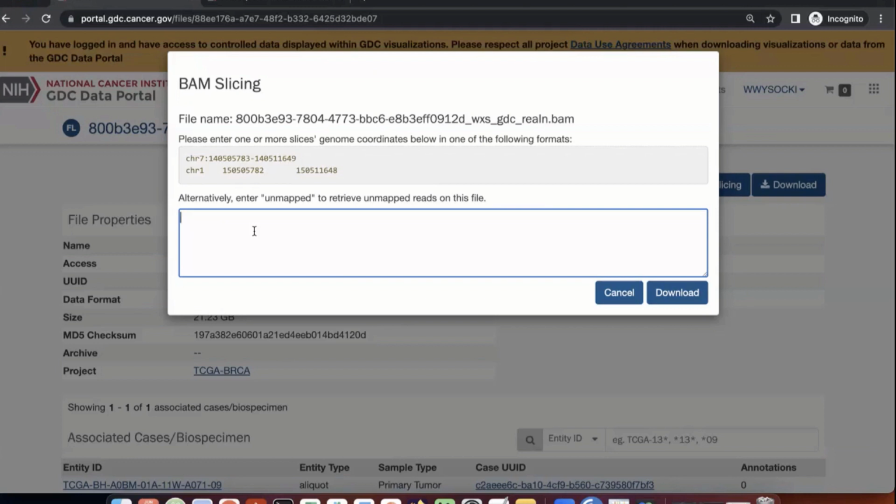So starting out, I'm going to put the first line, chr2 colon 1-20,000. What this is saying here is we have chromosome 2, and the first through the 20,000th base, I would like to be in this slice. For the next line, I'll enter chr19 with nothing after it. This indicates that I would like to download the entirety of chromosome 19.